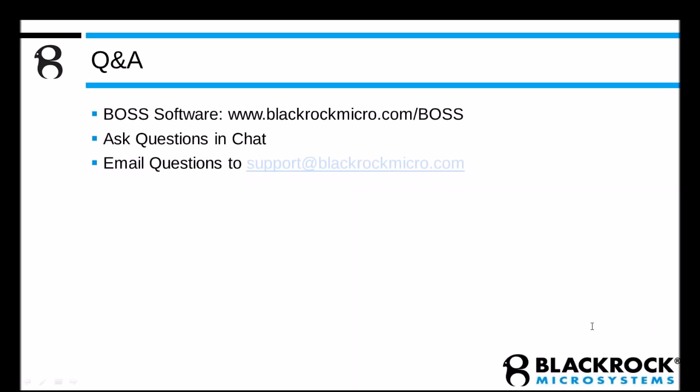Is there support for tetrode mode, tetrode files, electrodes? That one was actually answered publicly in chat. But that one is also coming soon. It will be prioritized slightly after some of these batch processing features. So that one is not slated for release in 2 to 3 months, but is more on the timeline of maybe 6 months out.